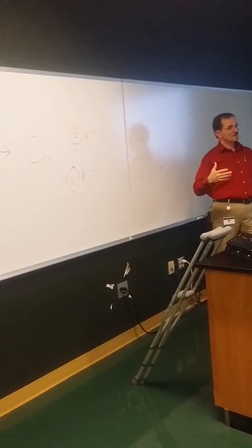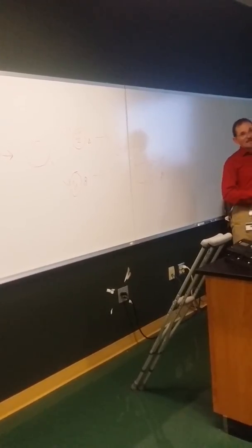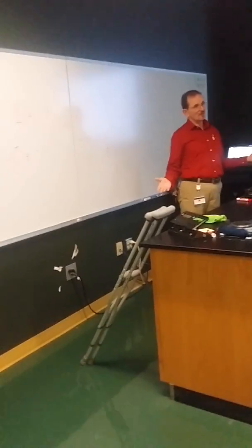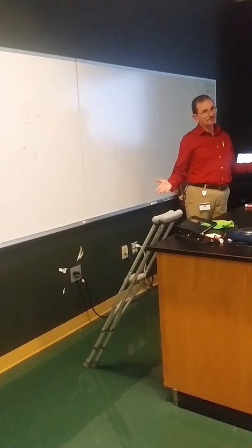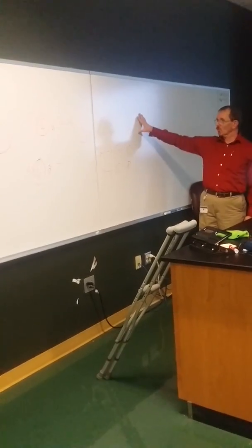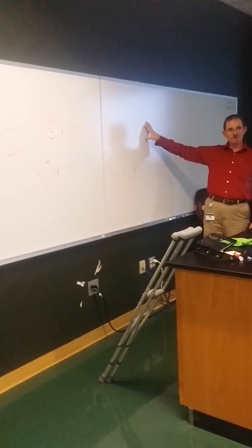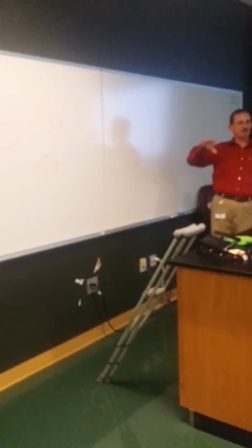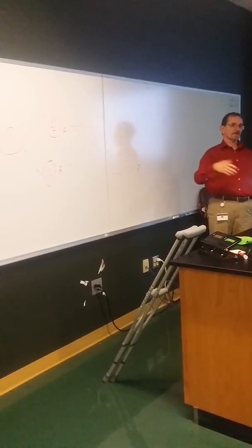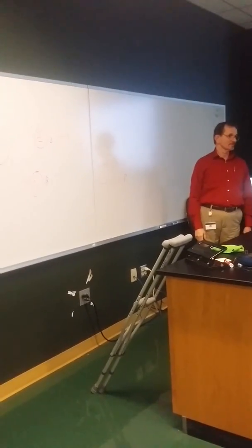So what happens then? They do a flow chart. They're doing the wrong flow chart. It doesn't matter which information you get from that flow chart because you're using the wrong bacteria. It's all garbage. Now, when you've got this and you're going down through these flow charts, you're going to be doing a series of biochemical tests. A lot of it's going to be as simple as putting this bacteria in a particular sugar solution and seeing if it eats it.